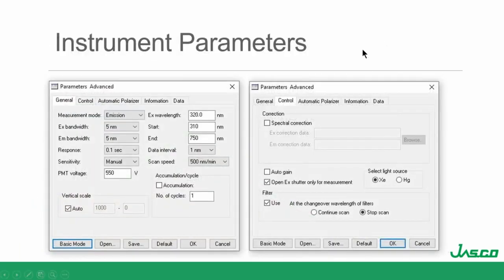So now that we kind of know where the fluorophore is, we want to look at what else we can do to optimize the signal, because right now we've really only optimized scatter. We have huge scatter bands and a very small fluorescent band.